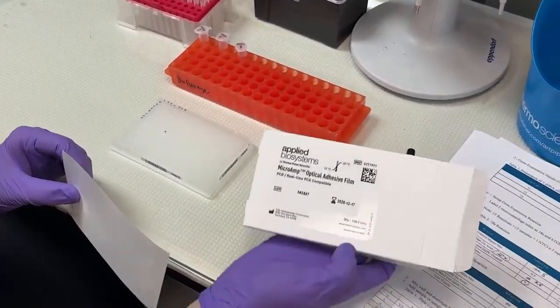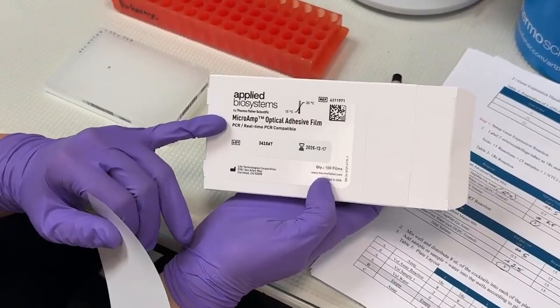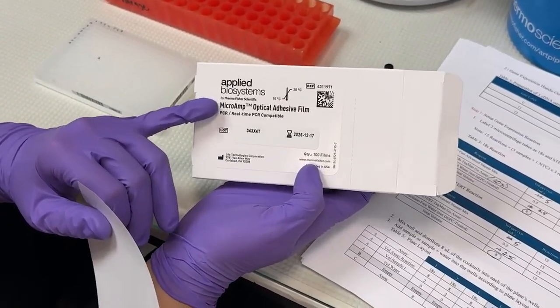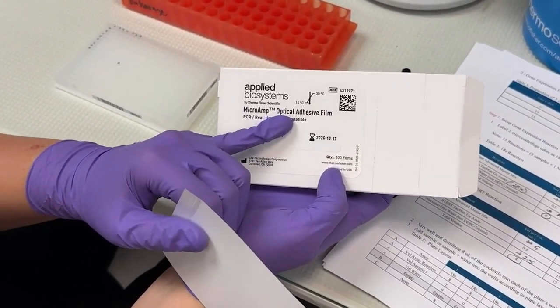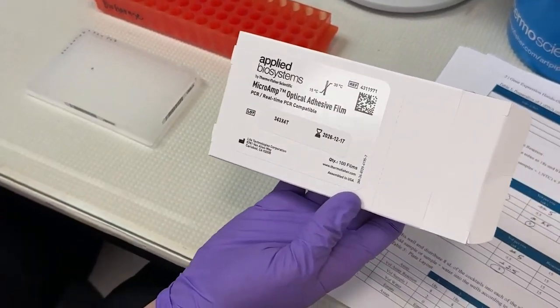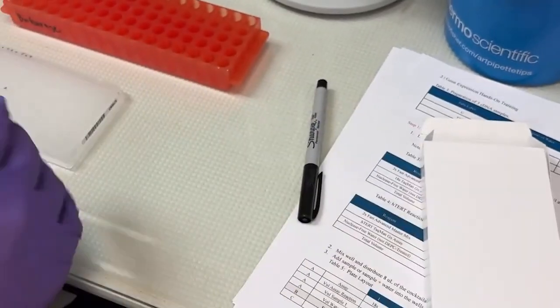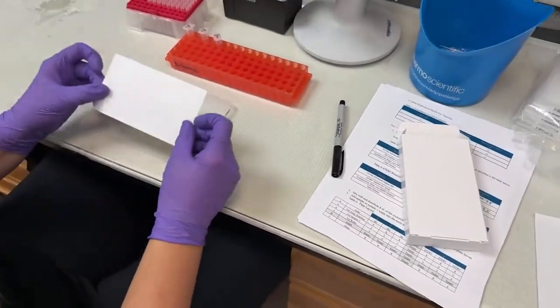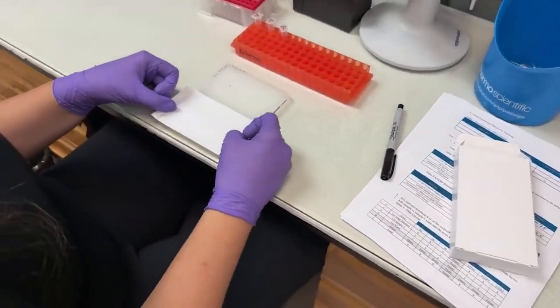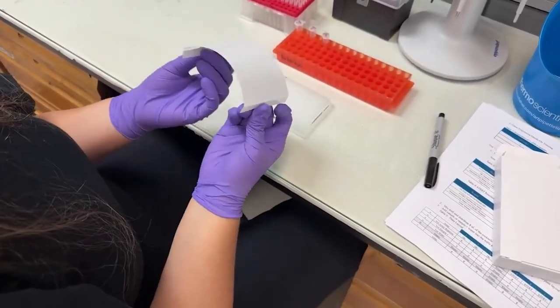This is the box of covers. They are called optical adhesive films. And it's the optical part that is really important. There are going to be other kinds of films that may be around. Just make sure it says optical. So these are made in exactly the right size to fit on top of the plate with some extra for you to hold on to.